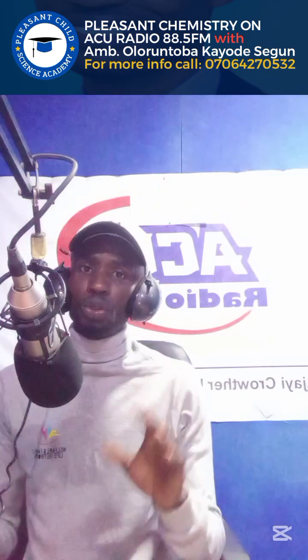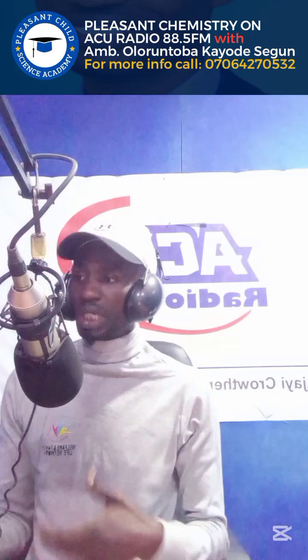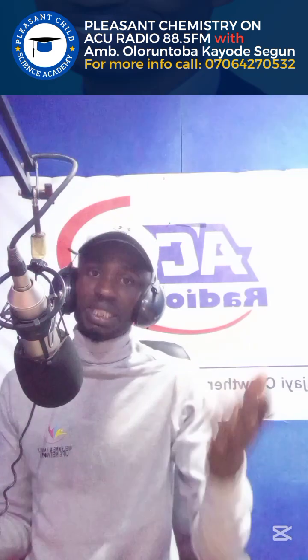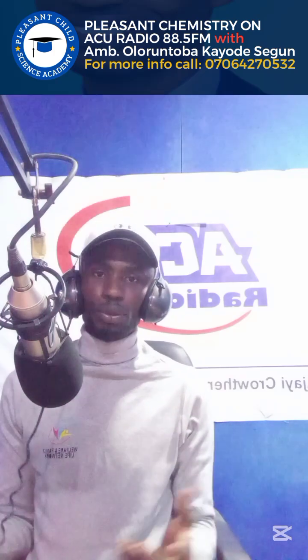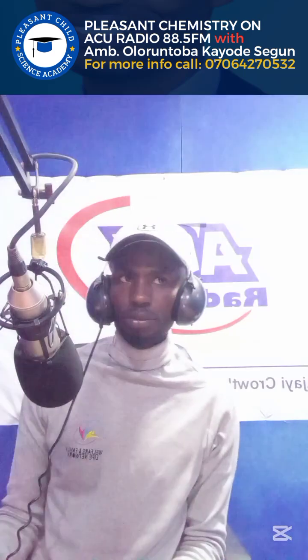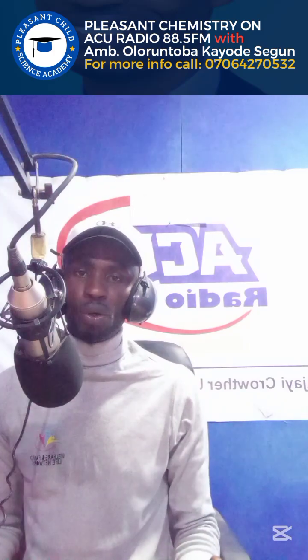So once you are able to obtain concordance values, by the time you want to calculate the average volume of acid used, you can just make use of those two concordance values. Let's assume that your first titer is 22.20. The second titer is 22.30. So you can pick the two and divide by 2. And that's how to calculate average volume of acid used.